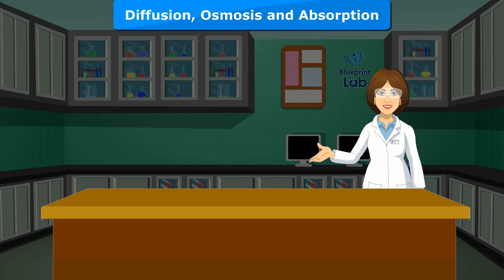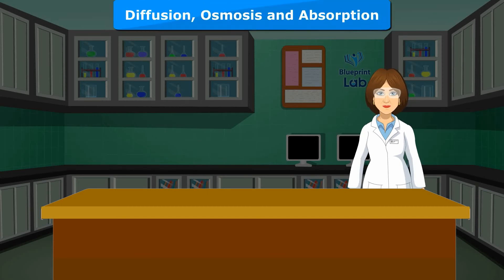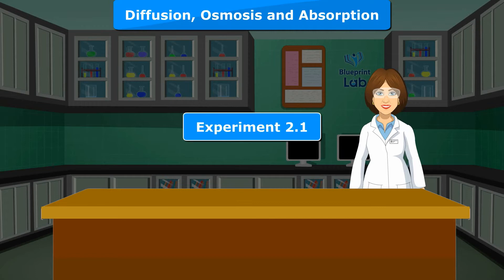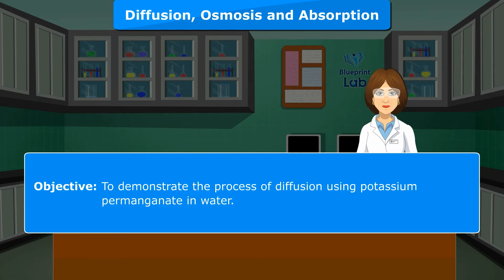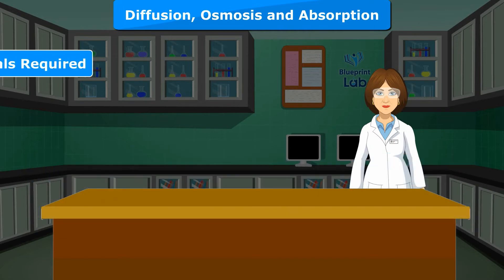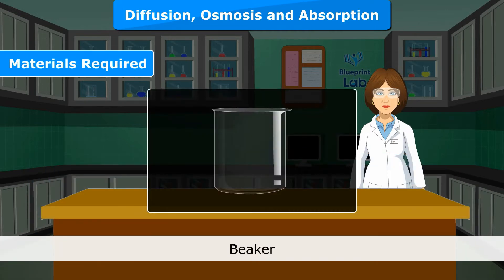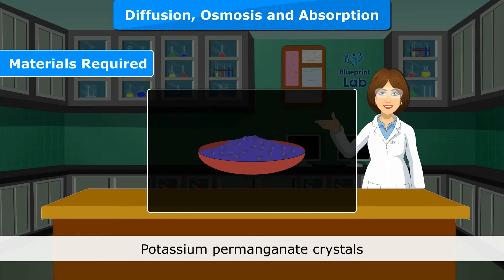Diffusion, Osmosis and Absorption. Experiment 2.1 Objective: To demonstrate the process of diffusion using potassium permanganate in water. Materials Required: Beaker, Water, Potassium permanganate crystals.